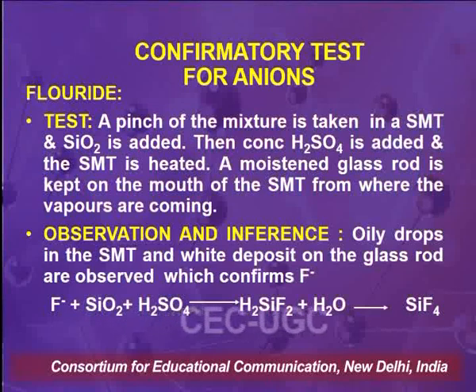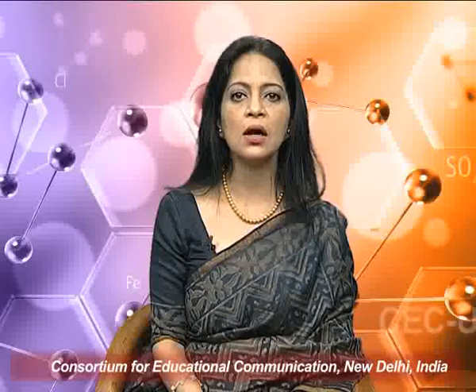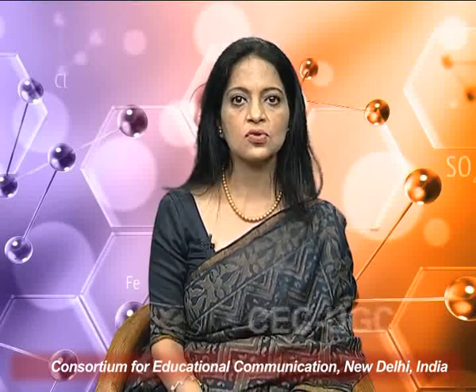presence of fluoride ions, which is evident from the chemistry over here, wherein fluoride ions react with silica or sand in the presence of sulfuric acid to form silicic acid, and further give SiF4 with water, or on the moistened glass rod SiF4 white precipitates are observed. So, this is all for today.